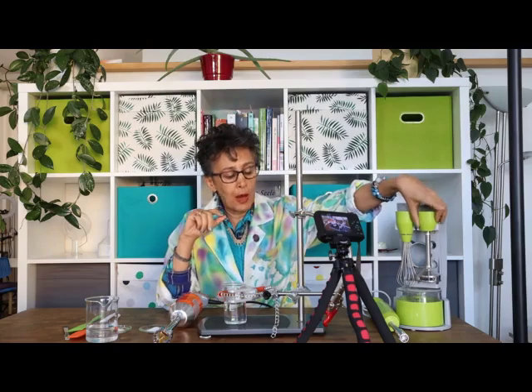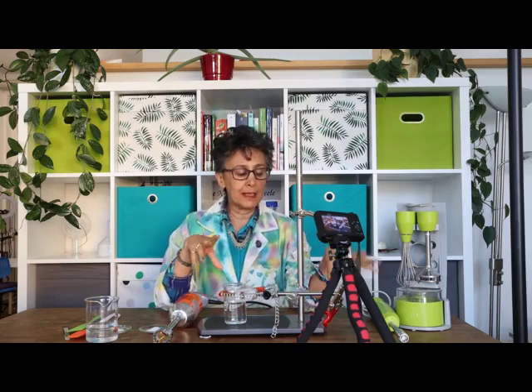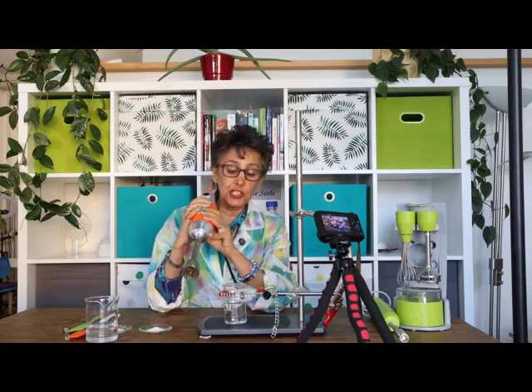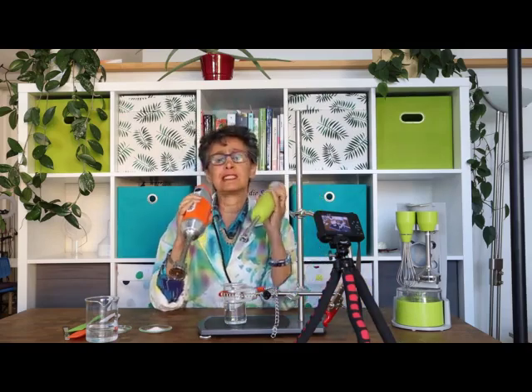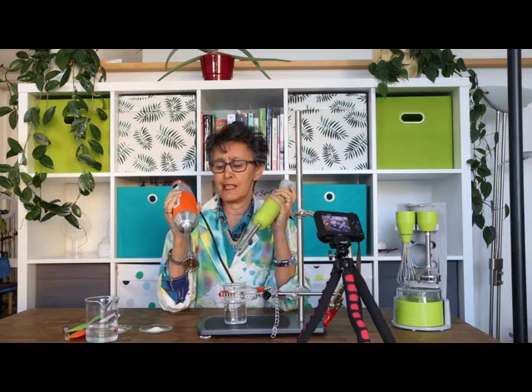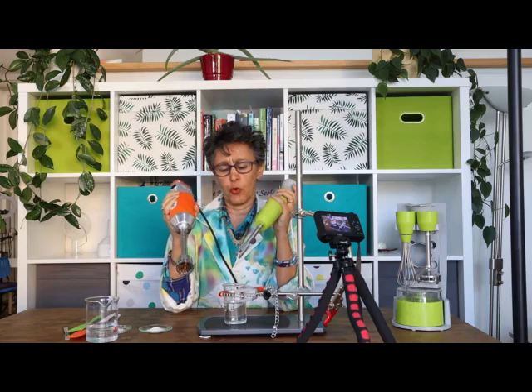To show you how it works, I am going to disperse gum in water and compare both instruments together. Dynamix is much heavier than Kai Blendia — this one is about 0.6 kilogram and the Dynamix is a monster at 1.2 kilogram, so you really need a steady hand and strong muscles to work with it.